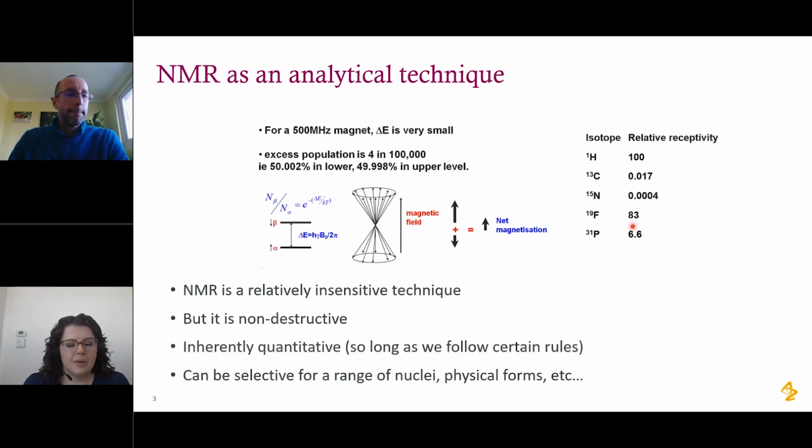Okay. In a similar vein, I think all of the examples that were shown today relied on heteroatom nuclei for detection of these impurities. And so is that pretty typical, that you're relying on a heteroatom for that selectivity?